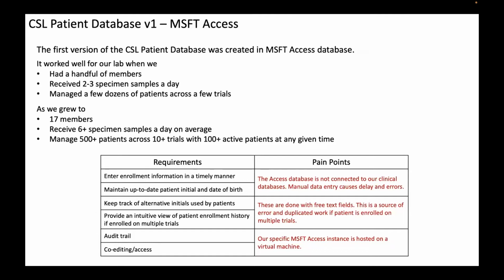And lastly, talking about Access, this database is hosted on a virtual machine here in Seattle Children's network. As more people are trying to access this database, the performance sometimes degrades and it lags, and that's not really what you want to experience in a busy morning when you're trying to receive multiple samples in a short period of time.